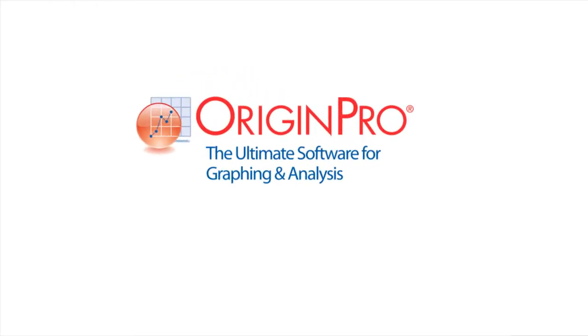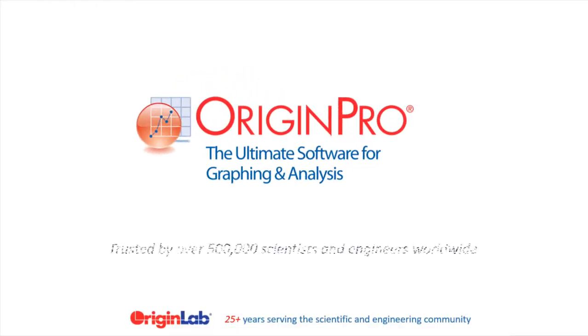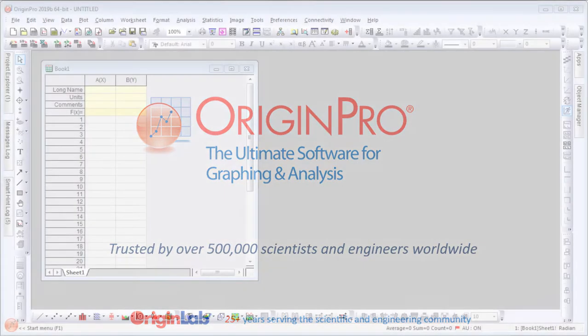Origin is a graphing and analysis software trusted by over 500,000 scientists and engineers worldwide.